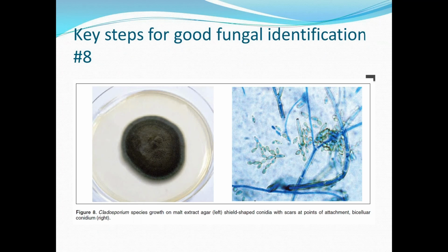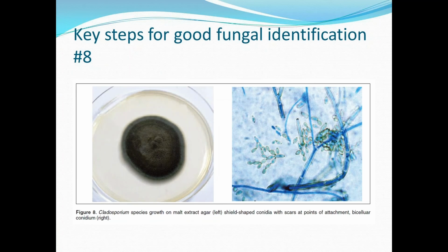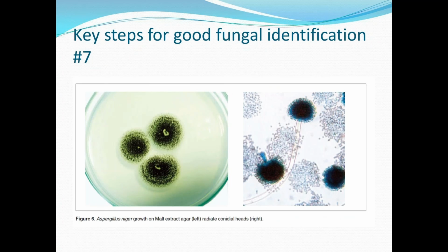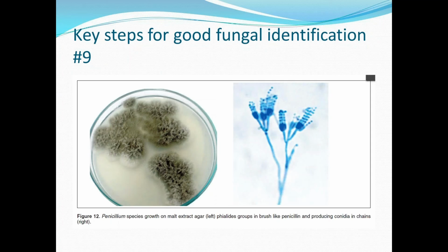And just one more example, we have Penicillium, common in soil, and this again has a very different appearance, both microscopically and macroscopically. So again, just pop back up to Cladosporium and to Aspergillus, and you can see how different these three very common types of fungi look.